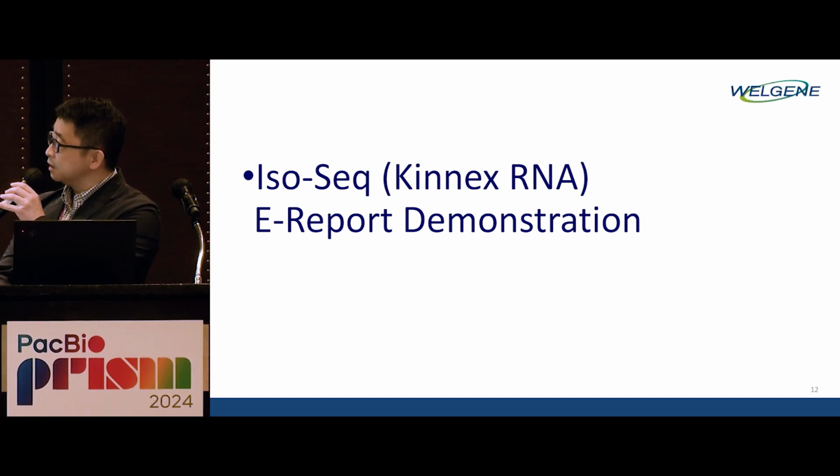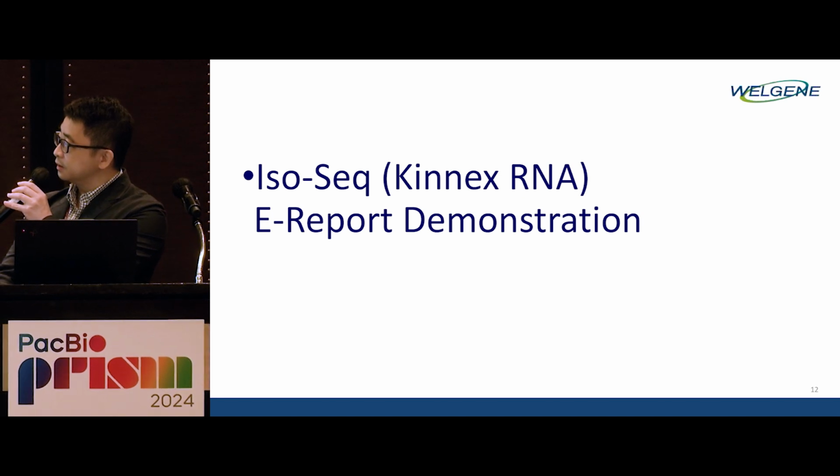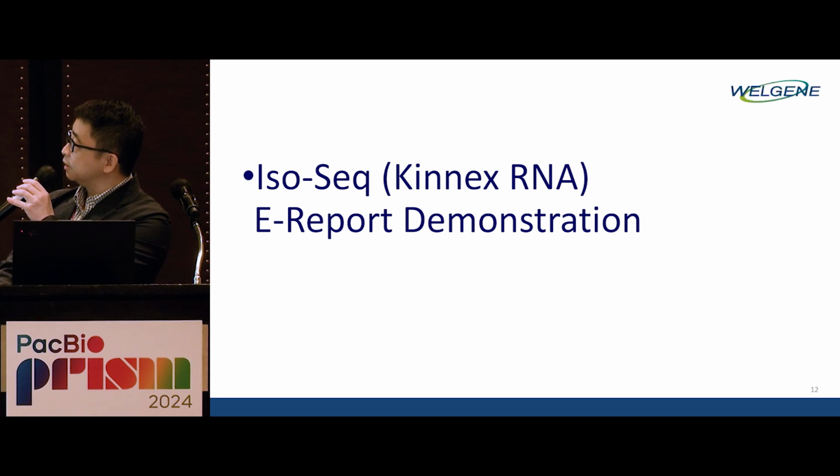Now you can see, you can choose which database you want. Then you can load the data, but it's a little small.